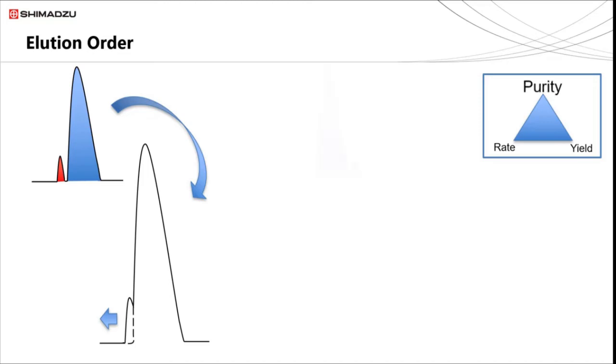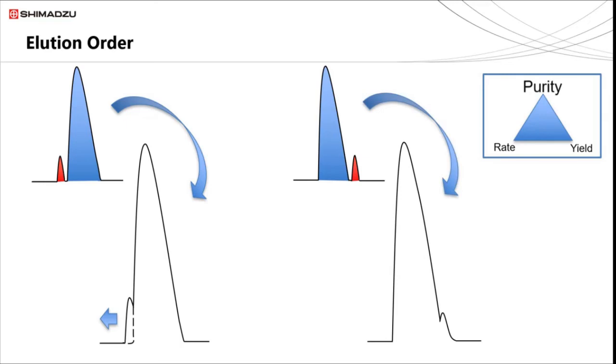However, if the impurity elutes after a major band, then as overloading occurs, in this case, the small impurity peak is tagged along by the major band, pulling it under and greatly decreasing the purity and therefore probable yield.